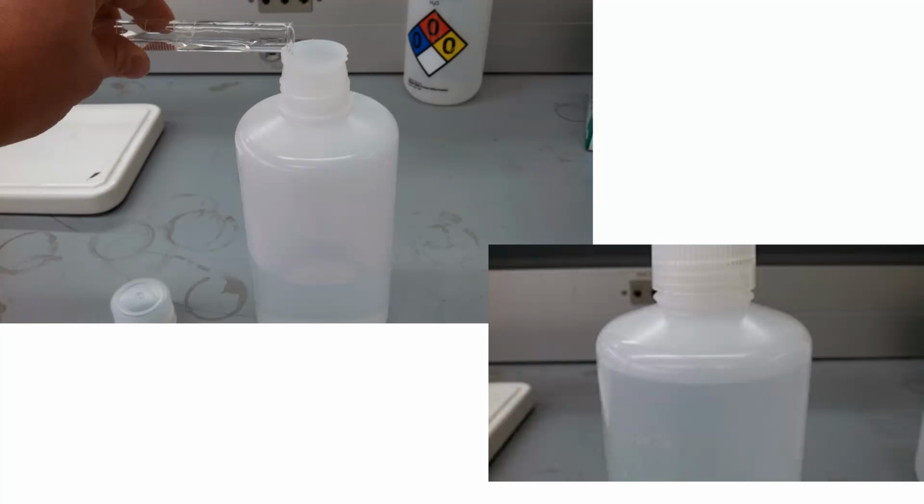If when you measure, you put in exactly 5.2 milliliters of sodium hydroxide, after you pour out of the graduated cylinder, the sodium hydroxide is viscous, so some of it will stick. You want to rinse that out with distilled water and pour the rinse into the Nalgene bottle. If you pour in a little more, like 5.4 milliliters, you don't need to rinse, just rinse it out in the sink. Once you've transferred as much of your sodium hydroxide as you can into the bottle, you're going to fill it up to the shoulder, as shown in the bottom right there. That means there's about 1 liter in there.